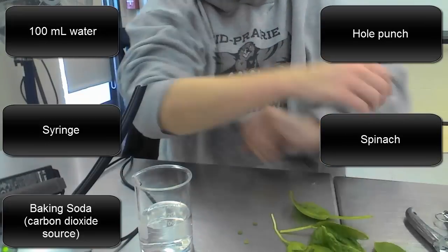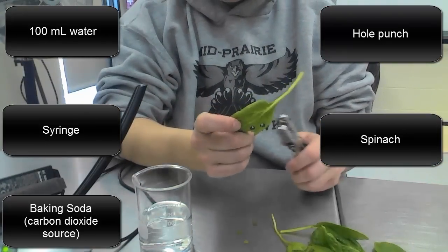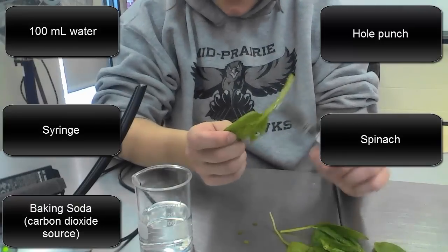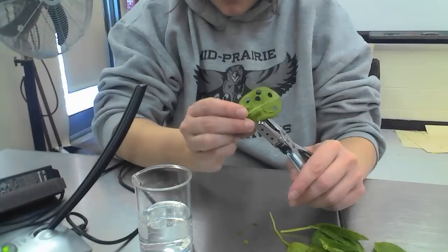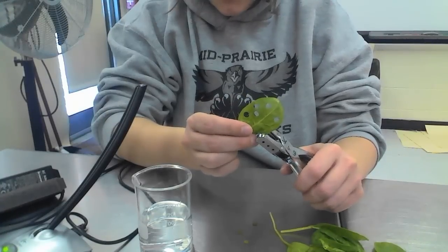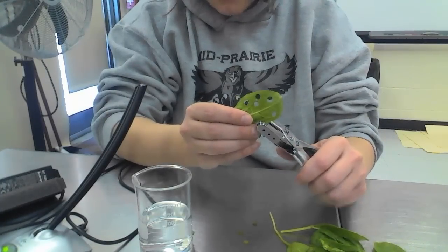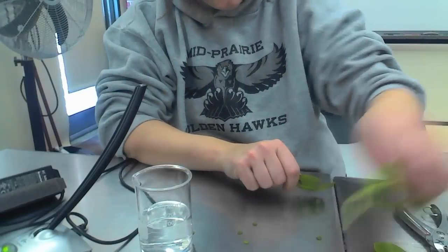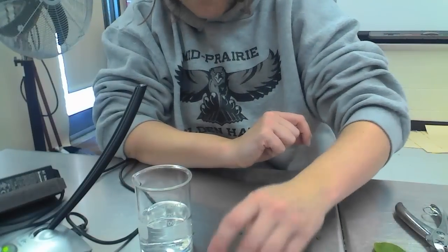All right, so to get started, you're going to need to punch some holes into your spinach so we can have these little discs, which are called chads. When you punch them out, make sure you're punching holes in the spinach in between the veins, the little lines on the leaf. You'll want to easily punch out 15, 20 of them, but you need to have at least 5.